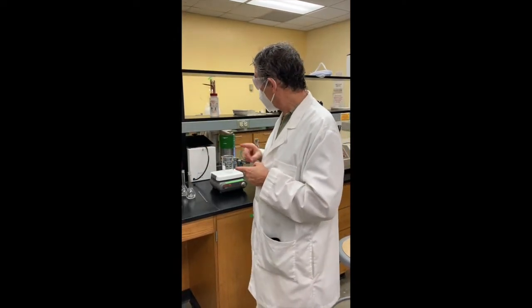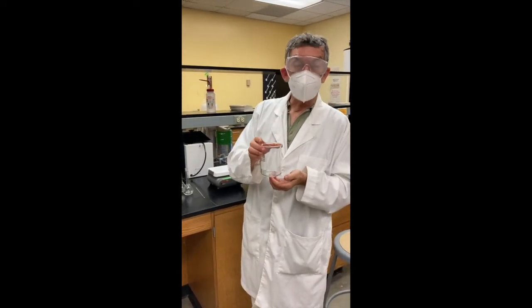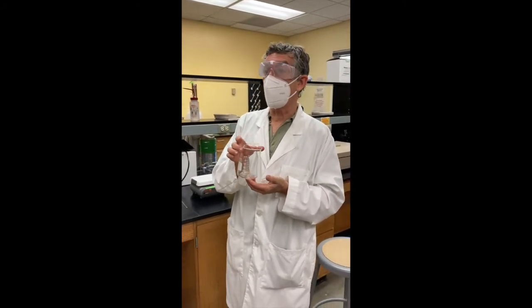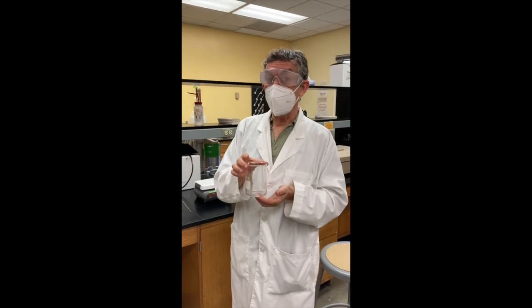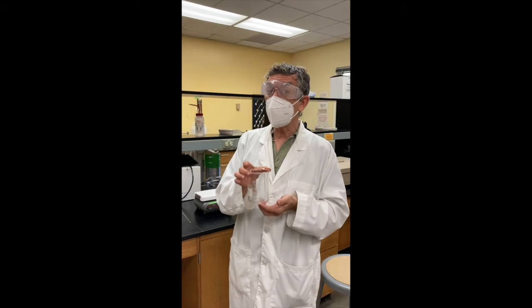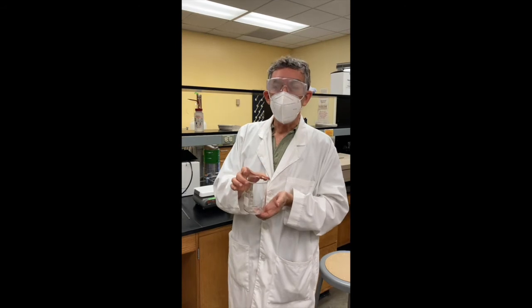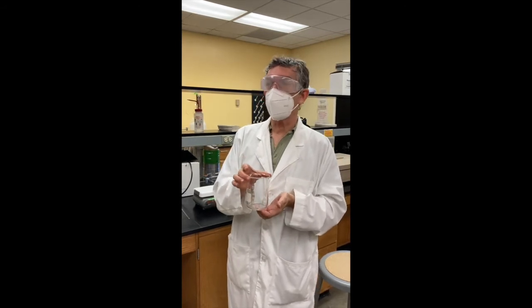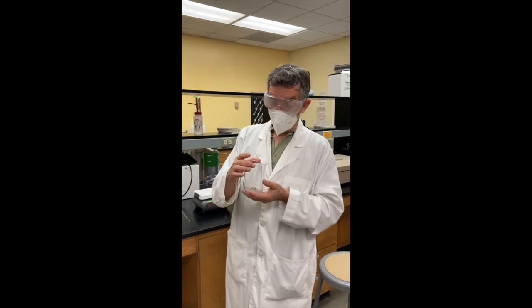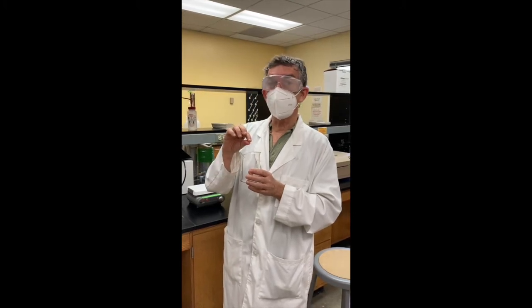And the second thing is, after you've created your solution with the polymer, you want to examine it very carefully to see whether there are any small undissolved particles. Ideally, there will not be any, and you want to do everything you can to eliminate them. But it will take a long time to get a truly homogeneous solution without the particles. If, after all your efforts, there are still particles left, you can follow the manual suggestion and pass the solution through some glass wool to remove the particles.